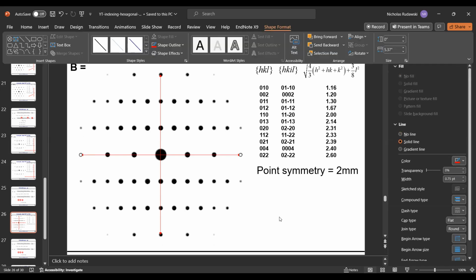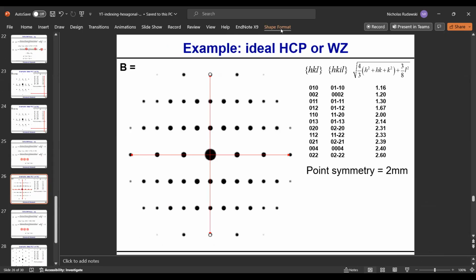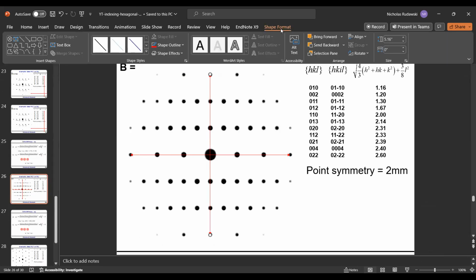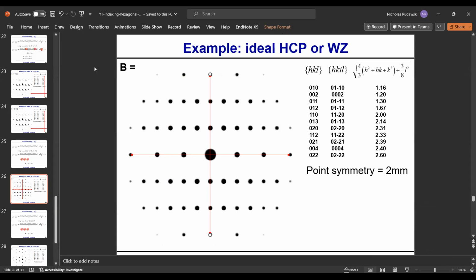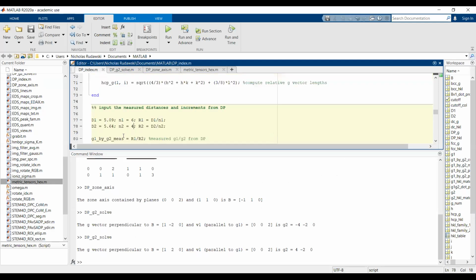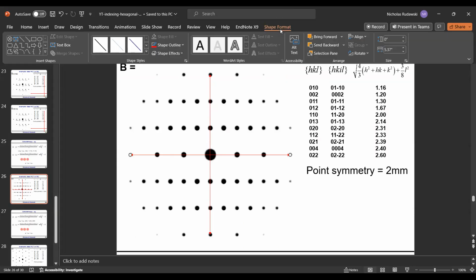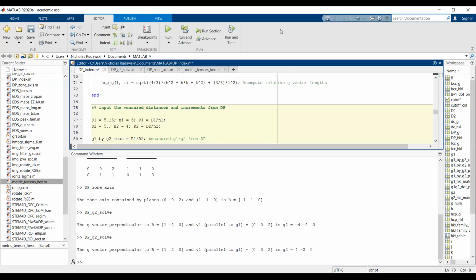Yeah, so that is a little bit longer. So we have 5.16 over 6 intervals. DP index. And we have 5.37 again over 6 intervals.